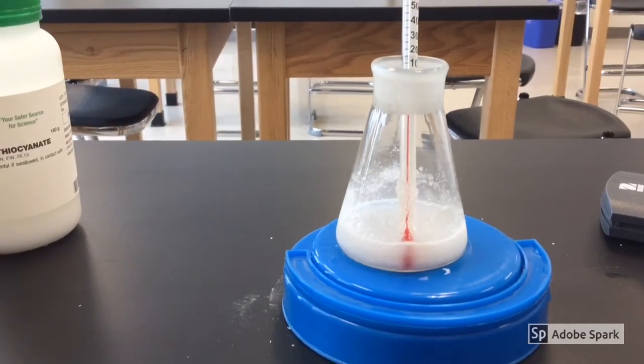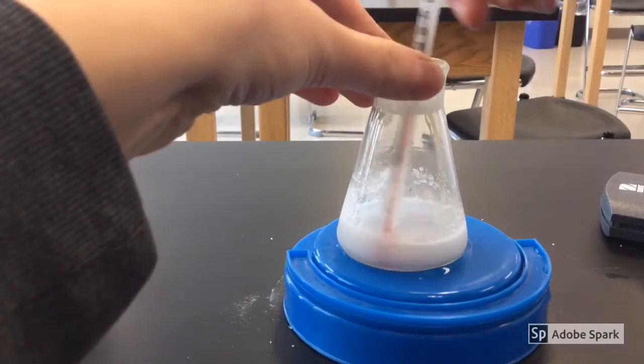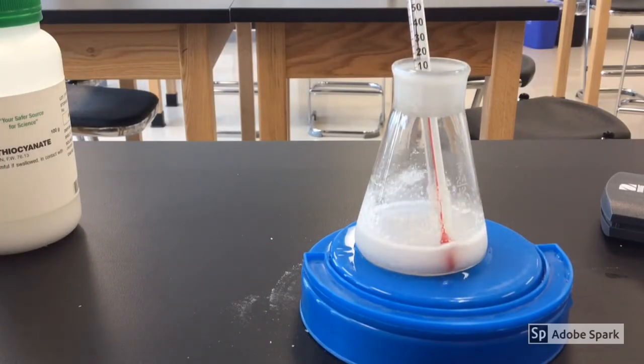We're just going to let that sit for a second. If you touch it, it's really, really cold — super cold. Remember, it's turned into a liquid now. They were two solids before, and now we just have a liquid that has formed. One of the products is ammonia, so it actually smells pretty bad. You guys can't really smell it, but it's definitely not pleasant. Another byproduct is water, so that's why it's gotten so liquidy.